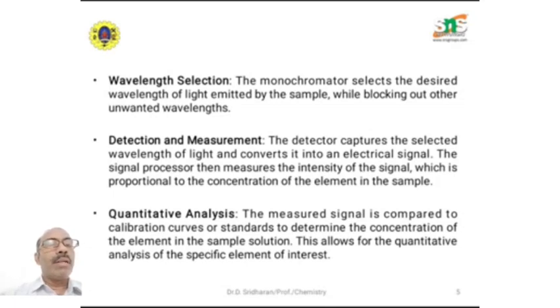Next we go for the analysis of the sample. The measured signal is compared to calibration curves or standards to determine the concentration of the elements in the sample solution. So this allows the quantitative analysis of the specific element of interest.